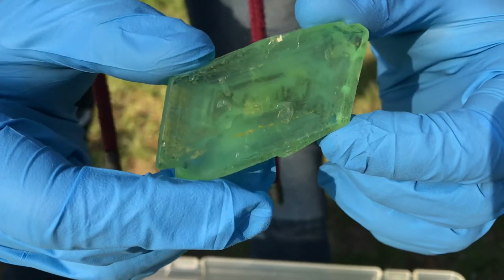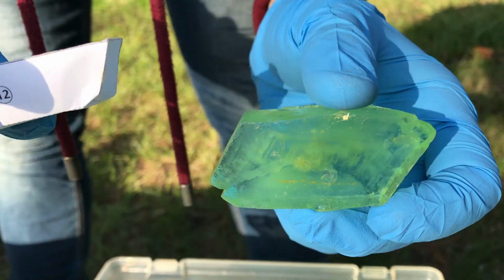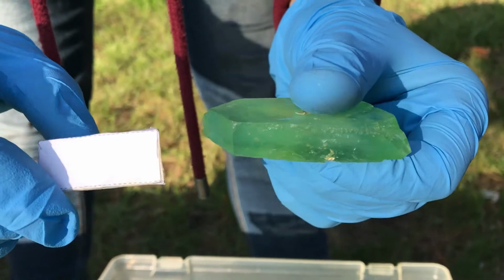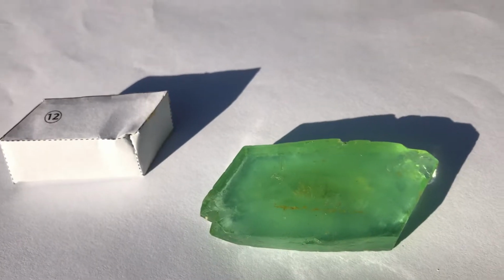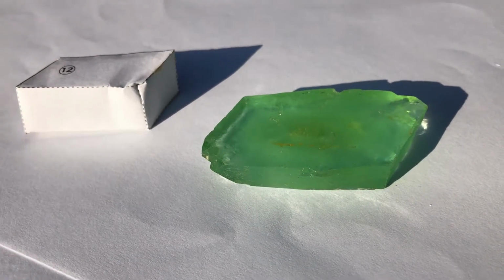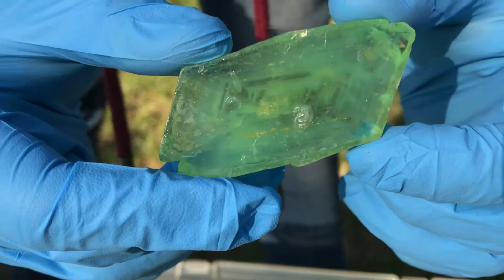As can be seen, the shape of my crystal is prismatic but with some defect. We can see that some faces have irregularities and flaws. Also, the crystal is not fully transparent. All this testifies to the defects in the crystal. The defects in the crystal are due to the temperature fluctuations during the growth, the presence of dust in the solution, and the resulting iron oxide contamination.